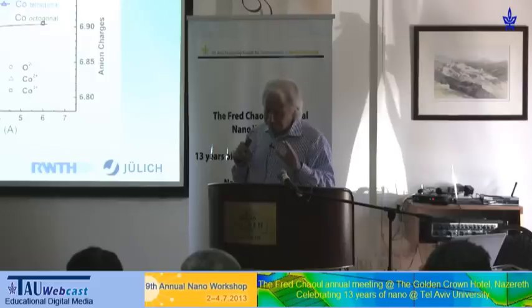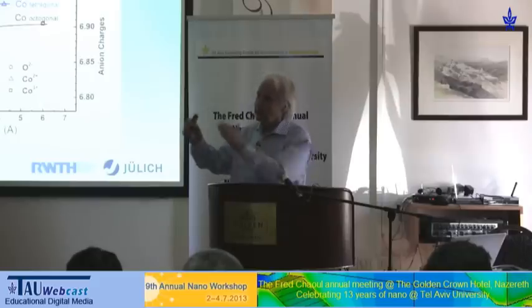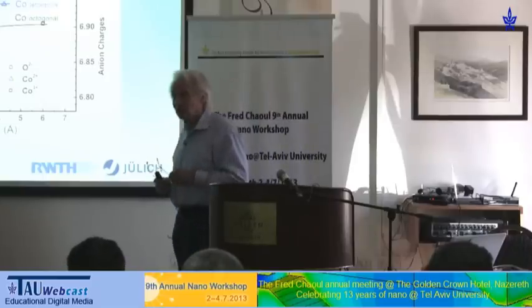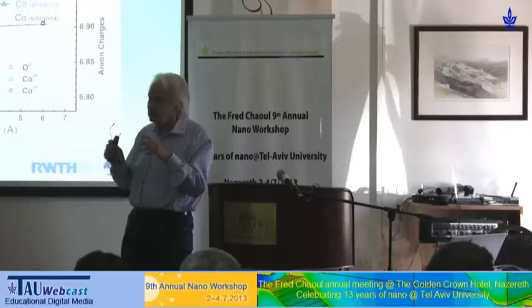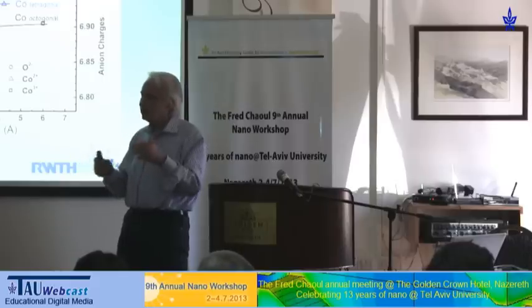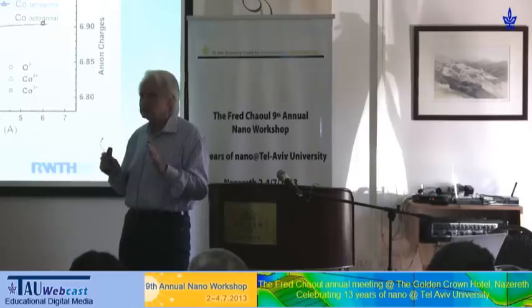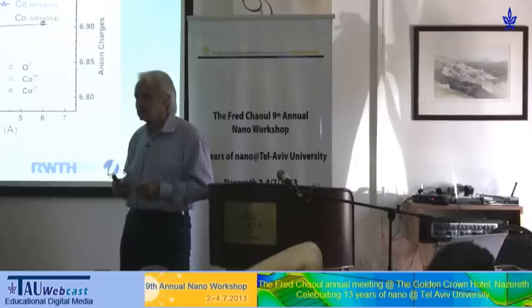But in the beginning we combined the electron microscopy high resolution group, led at that time by Junlin Jia, with the people who did the layer deposition. And there we found out the parameters which we had to optimize to get these wonderful junctions. So that's a direct interplay of atomic resolution with layer deposition. But what really helps is the sputter deposition, because this gives you very well-defined layers.